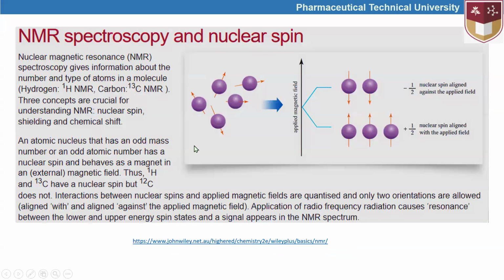Okay, and this is another example where we can understand that different atoms have their magnetic field in their nuclei that have different directions, changing around the magnetic momentum, yeah, and spin, of course. But under the effect of the applied magnetic field, we can observe this kind of spins.